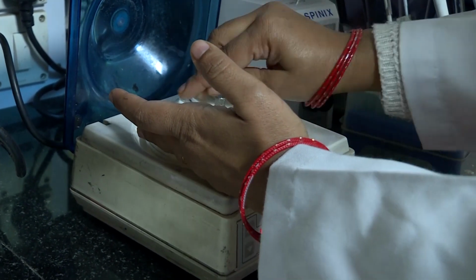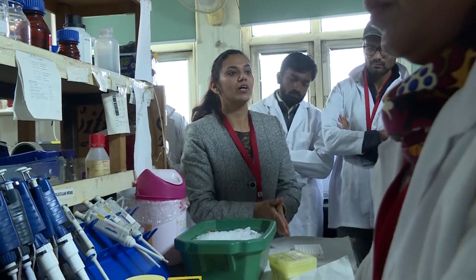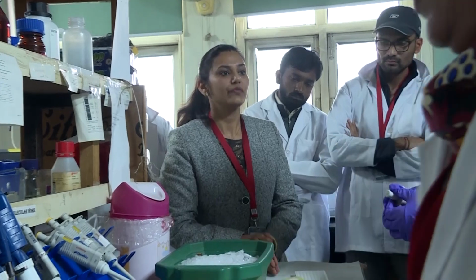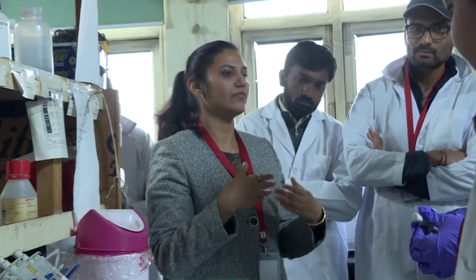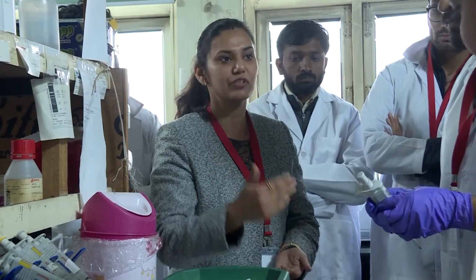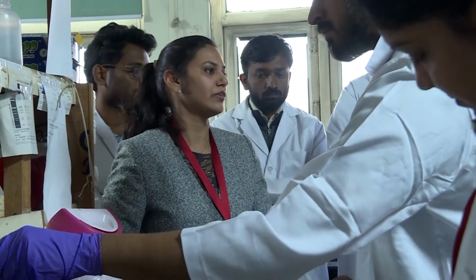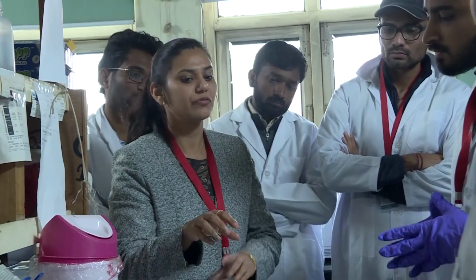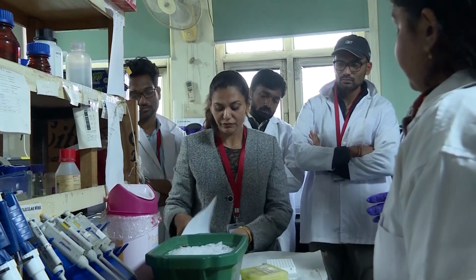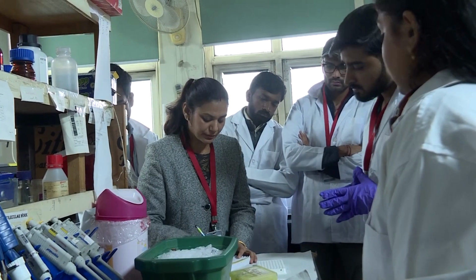Before distributing it, we have to draw it in our copy, noting in which well what we are going to add, for our record. Otherwise, if we forget in which well what we have added, we may get confused, because we require calculation of each well. So it's better we draw it in our copy. For that, we can make a similar plate.